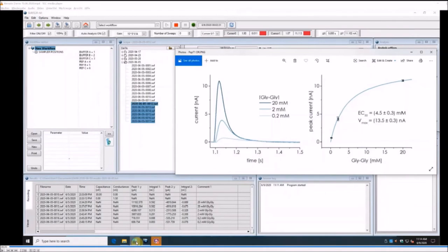And then a follow-up question, is it possible to test voltage? So the system itself has no voltage control. Because actually the change of voltage is our readout. So we cannot apply a voltage during the measurement through the amplifier. So that means we always start at zero membrane potential and then watch the building up of the membrane potential.